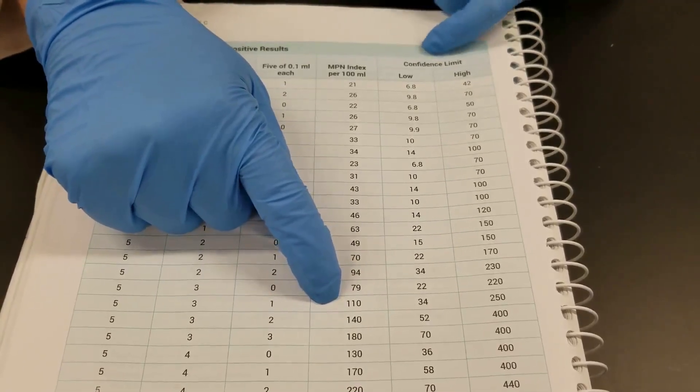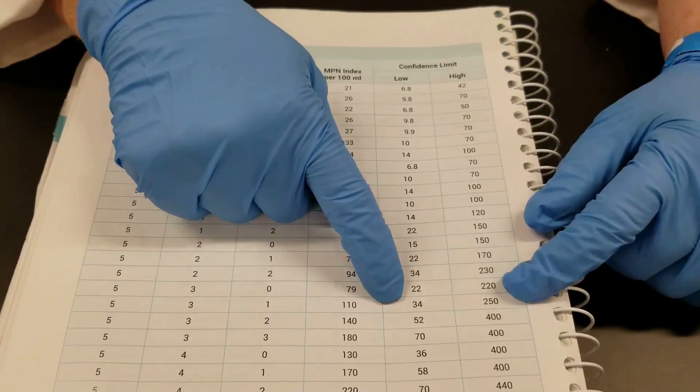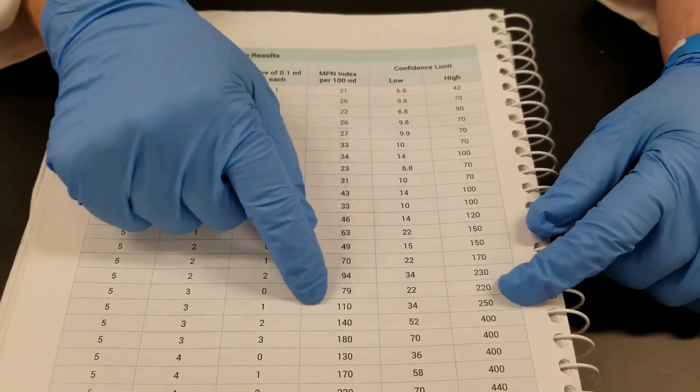Your confidence level here, think of it as the low would be 34 and the high would be 250.